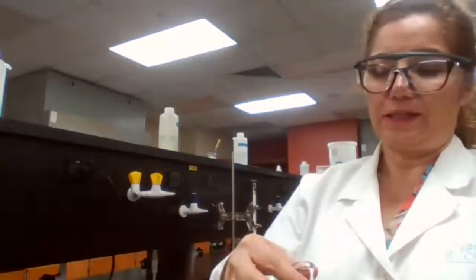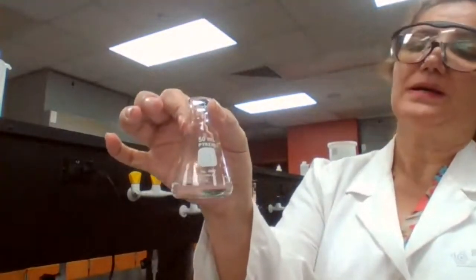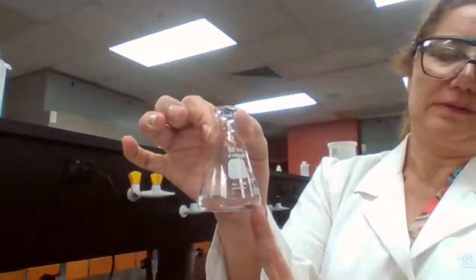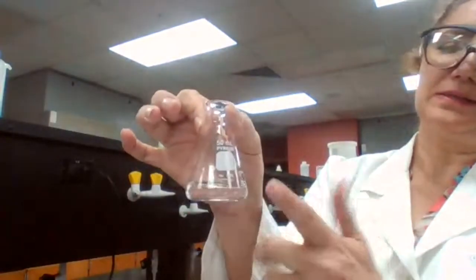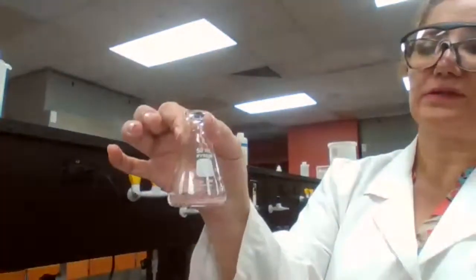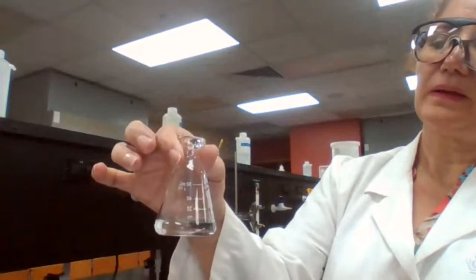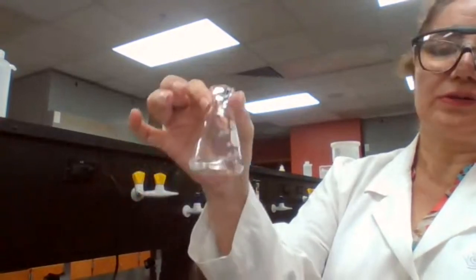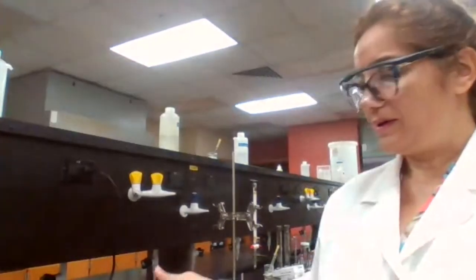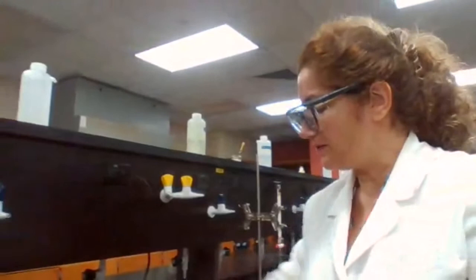And the fraction 1, which is the fluorene, has no yellow color and decent volume. So I didn't start too late, or I just stop collecting too early. So that is the qualitative analysis of the second part of the experiment.